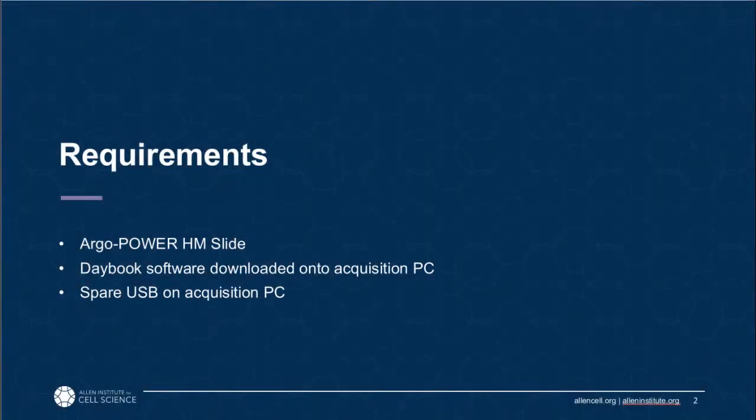I will be using an ArgoPOWER HM slide as well as the associated Daybook software, which is downloaded onto our acquisition PC. We will also need a spare USB port on this PC. I will be using a ZEISS confocal spinning disk microscope with a 10x air objective.